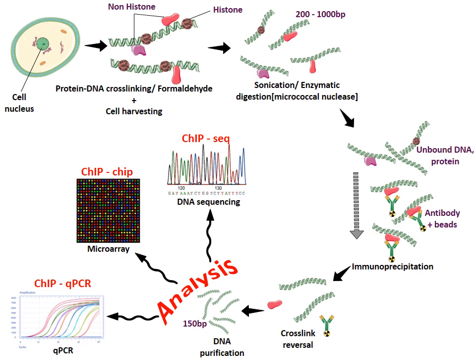The immunoprecipitated samples are then processed for cross-link reversal, usually by extended incubation at 60 to 65 degrees centigrade, where the associated proteins and antibodies are released from the DNA sequences. Then after DNA purification, the enrichment of certain DNA sequences can be analyzed either by quantitative real-time PCR or microarray or DNA sequencing.